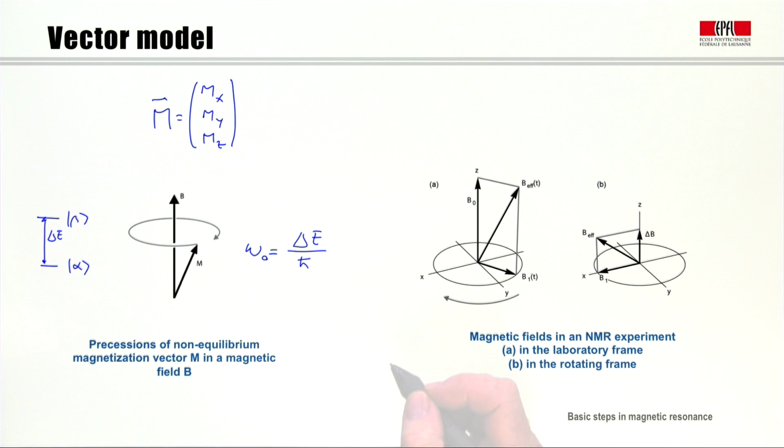It turns out that there is a bit of an argument about that. Basically, the clockwise rotation was common in the NMR literature until the mid-80s, and was mostly used by Ray Freeman, who had made many beautiful pictures that used that notation. And then suddenly in the mid-80s, Richard Ernst at ETH Zurich decided that was wrong and that we should really rotate counterclockwise. Now you might say this is irrelevant, but in fact it turns out that there is a lot of confusion in the literature because people have mixed these two conventions.